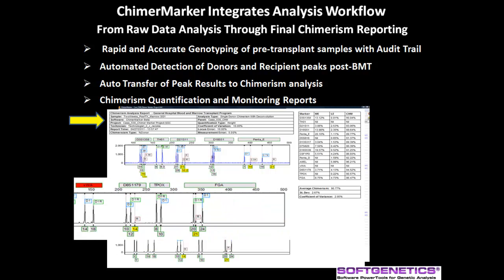The report also includes electropherograms with peak labels designating origin — donor, recipient, or shared — as well as a summary table of calculation results including mean error, locus error, and chimerism percent.